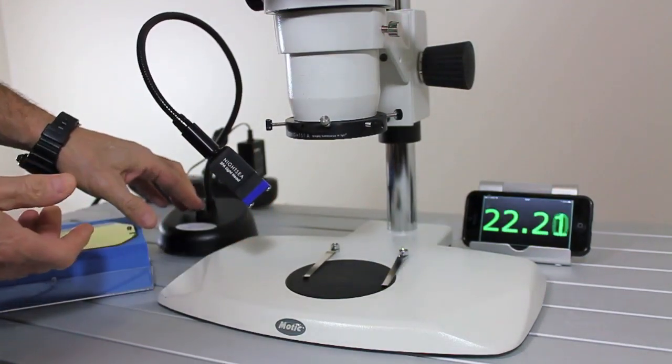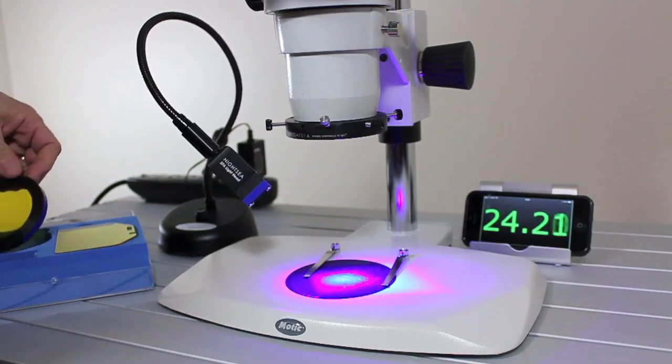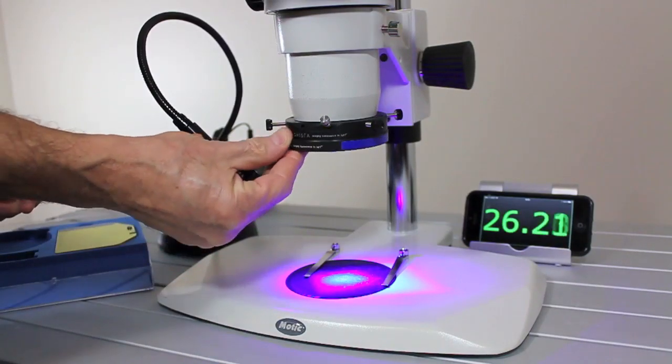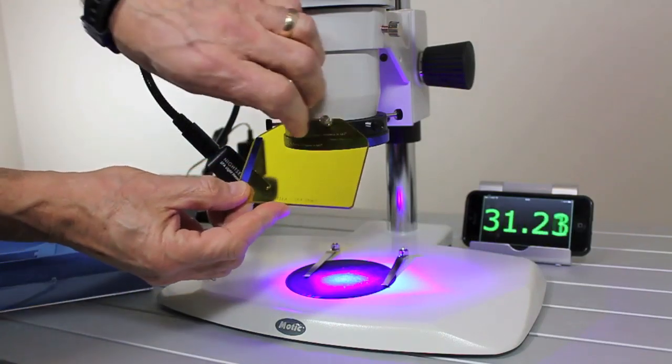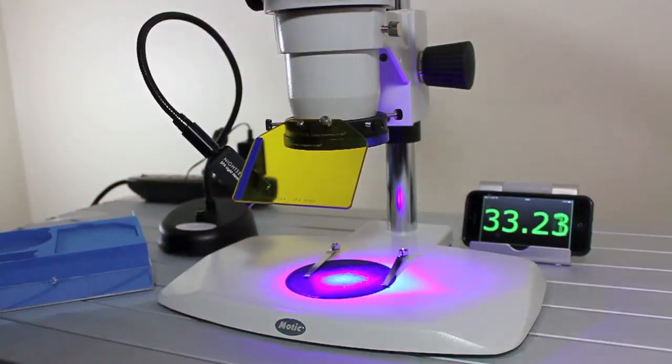Insert the light head, barrier filter clips on magnetically, shield slips in, tightens down, and we're done.